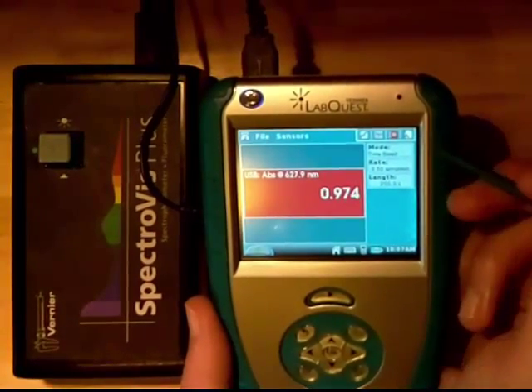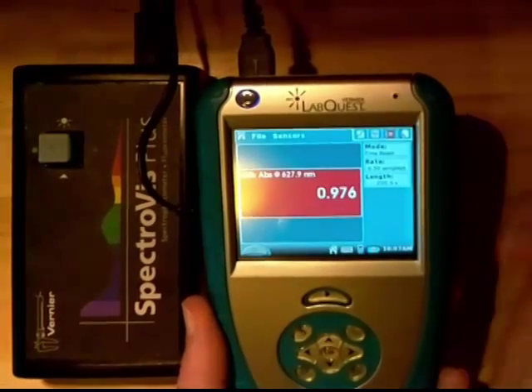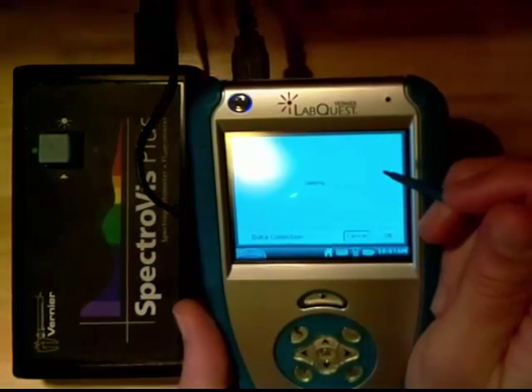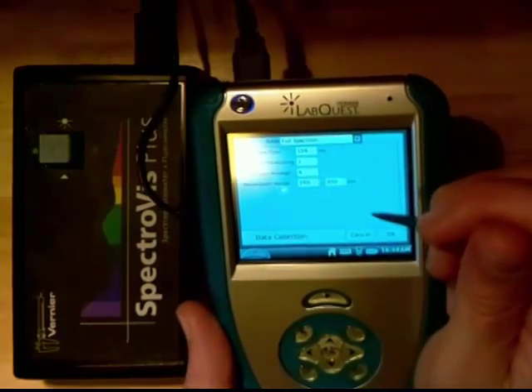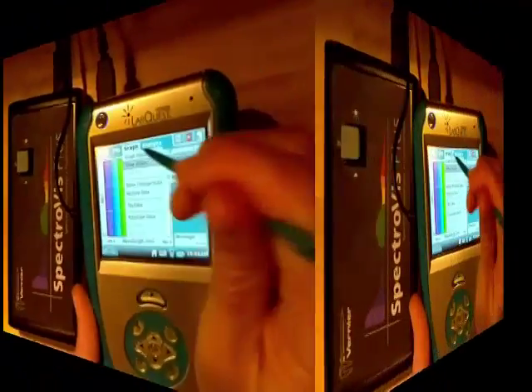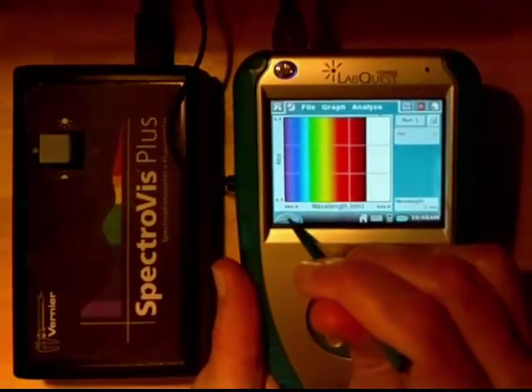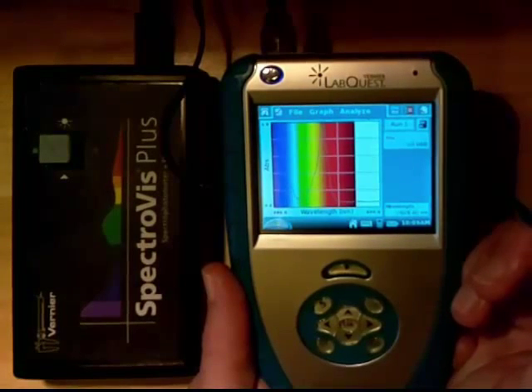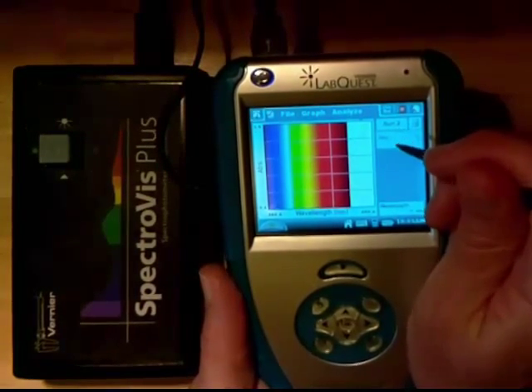If you're familiar with using a Spectrometer 20, I like to refer to this as 'Spec 20 mode' — it's very similar to that. Let's go back to mode and demonstrate full spectrum one more time. Click full spectrum, hit OK. Now I'm going to collect the spectrum of this sample, then hit stop. If I want to compare that to the red one, I can go up and hit the file cabinet icon — that stores it. Notice how it now says Run 2. So I can go and swap in the red one.